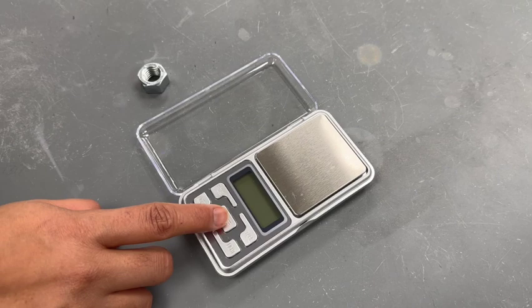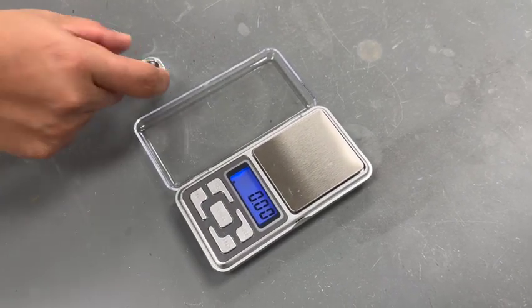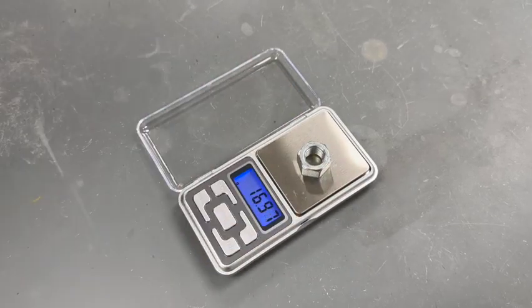To directly weigh the solid, turn on the balance and allow the mass to read zero. Place the solid on the balance and record the mass in grams.